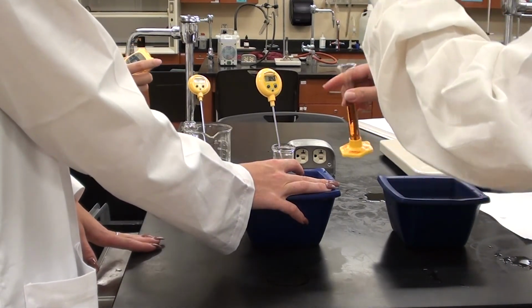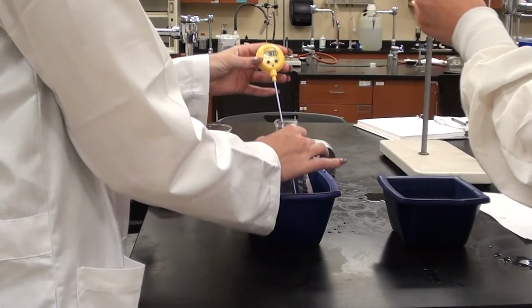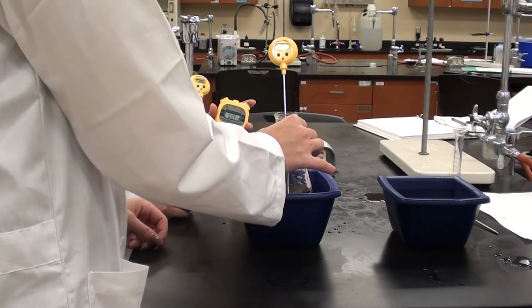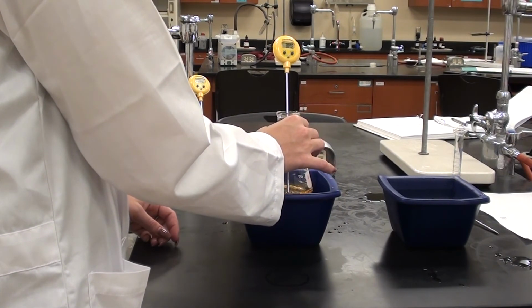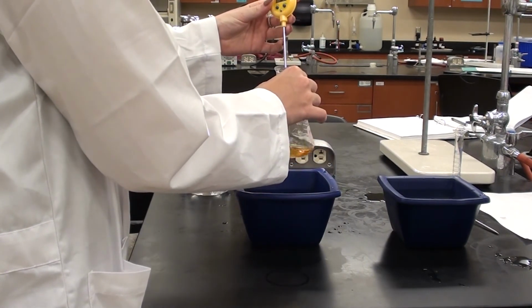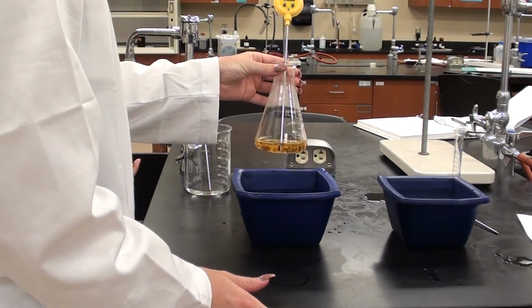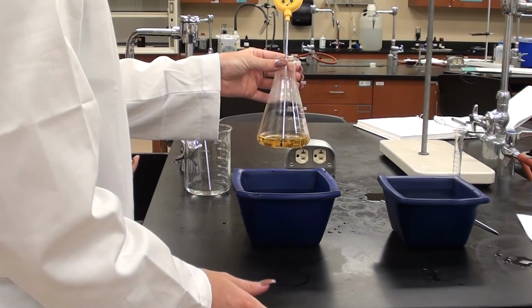Okay, you ready? Okay, so go ahead, add them together, give it a little bit of a swirl, Delaney. The temperature here is at about 38.4. I don't need to see the timer in the shot, that's okay. So go ahead and give it a swirl. Could you take it out of the container here? It looks like it's going to stay at about 38. It doesn't take very long. It's about 38, 39. So if you keep it within a 1 degree range, that's pretty good.